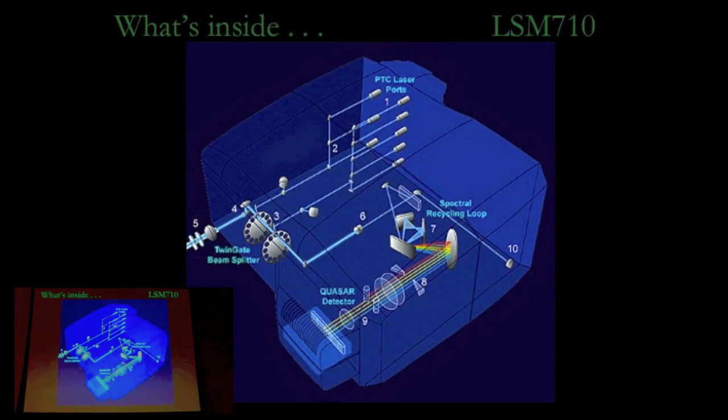So for different wavelengths, do you use the same pinhole, or do you usually just, in this design, it's the same pinhole used for all the channels. Does that affect the resolution in different regions? Yeah, the optimal setting for the pinhole will vary by wavelength. So you'd set the pinhole to accommodate the shortest wavelength that you were detecting at that particular time.